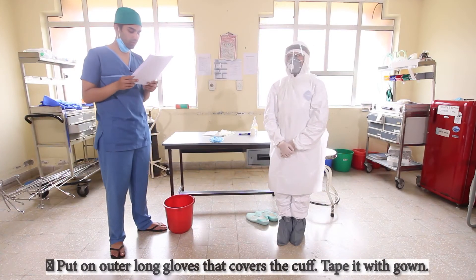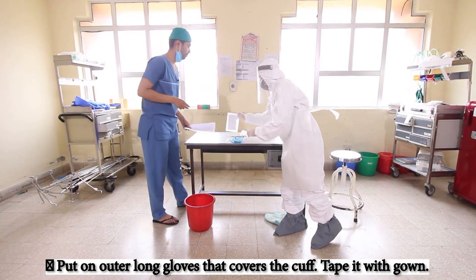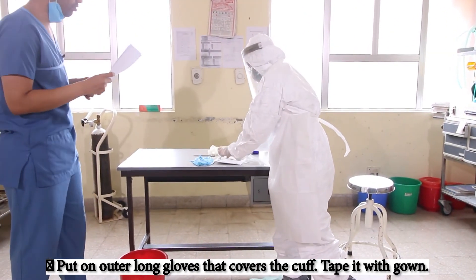Now we will move on to put on the outer gloves that cover the cuff. I will help to tape it to the gown.